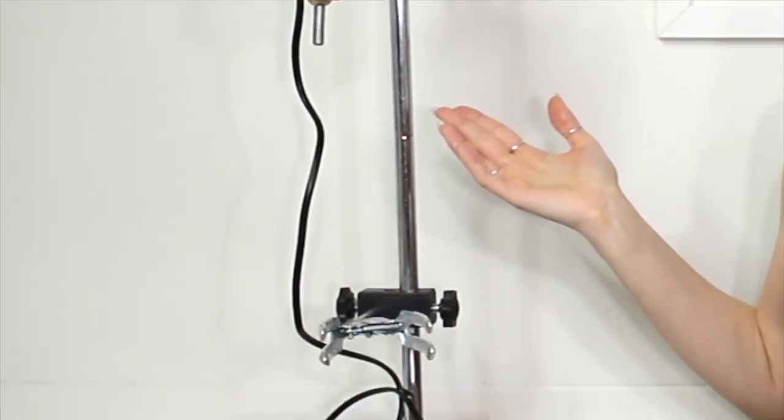Today I want to give you guys a little review of this overhead mixer I recently purchased. You may have seen it over on Instagram — I posted a poll asking if you want to see a review on it, and 90% of you said yeah, so here I am.